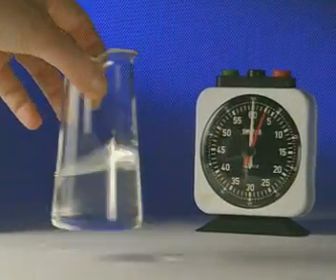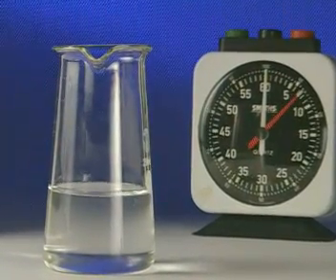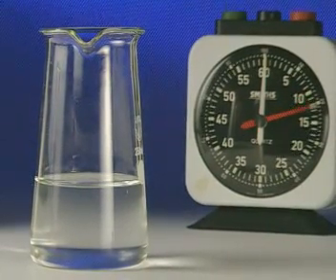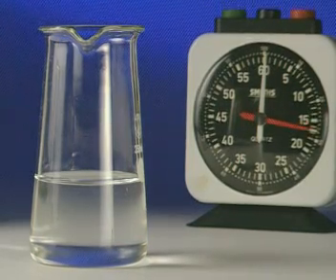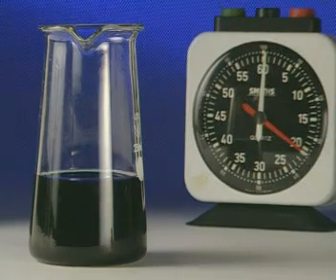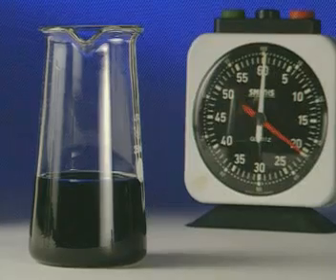With this reaction, the initial mixture is at a room temperature of 25 degrees C. It's colourless, but the moment that one of the reactants is used up, it changes suddenly to deep blue-black. It takes just 21 seconds.